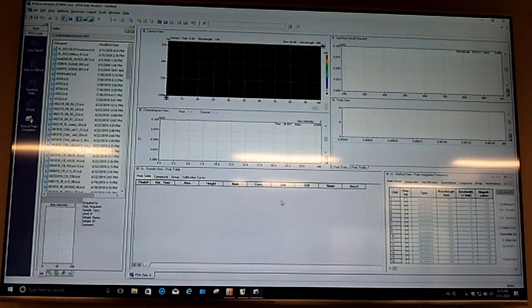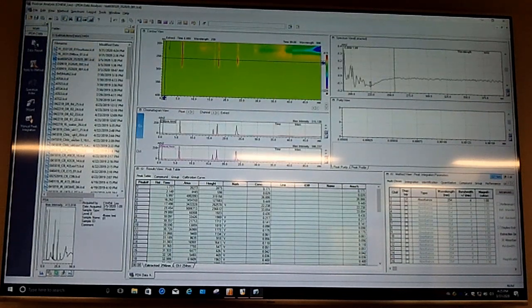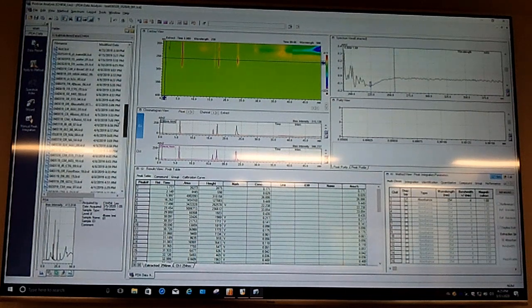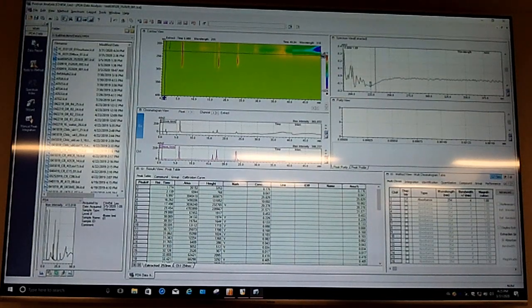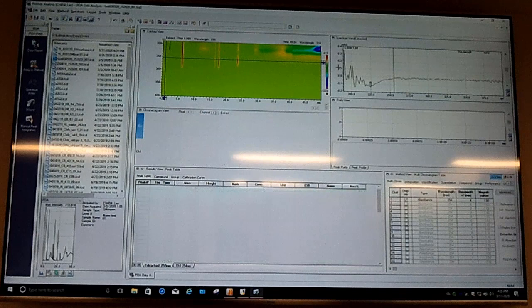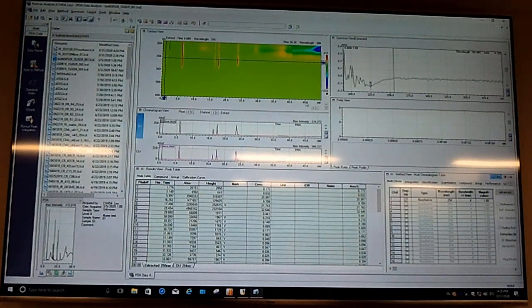And then maybe we open one spectrum. You just find the spectrum, so you want to open it. Drag it down. A lot of files here. And then next you see that's the adjusted wavelength. You see there's some change in this window, so that's different wavelengths. That's the real-time UV trace. And here it shows you the UV spectrum at a certain time.